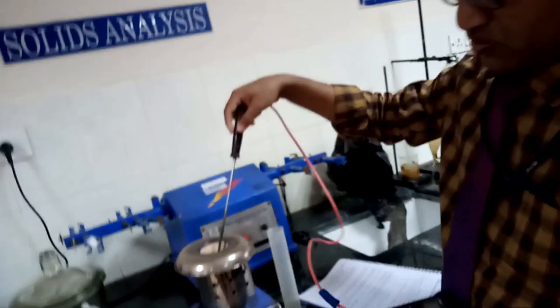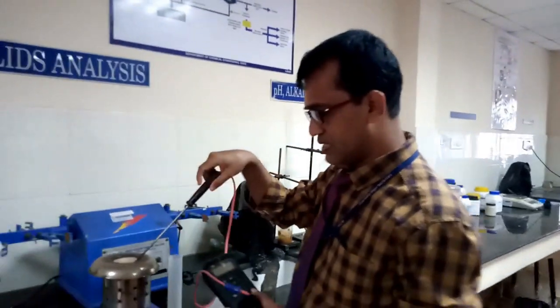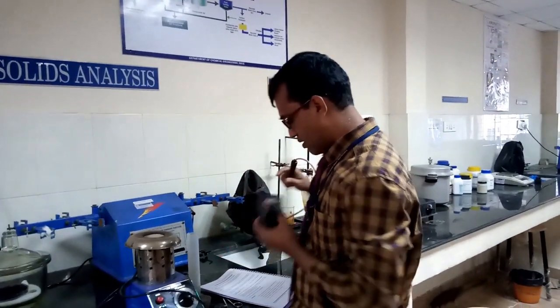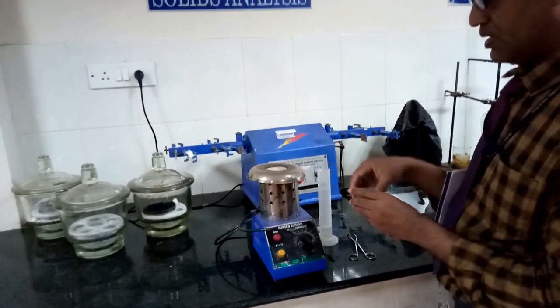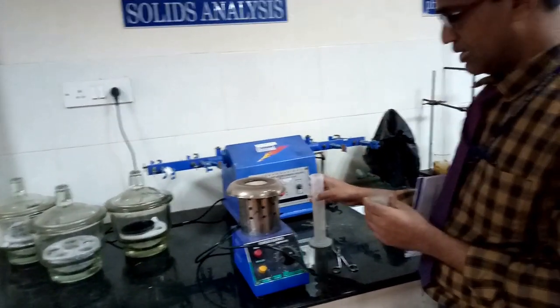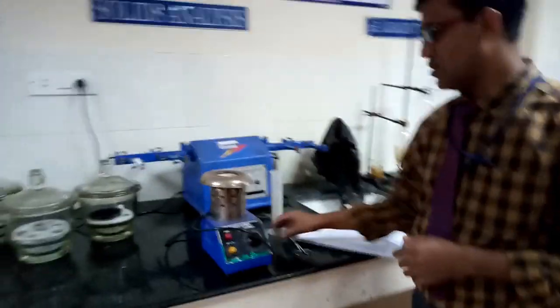You can find out the temperature by using the temperature probe, and the display gives the temperature inside the furnace. Once it reaches 550 degrees centigrade, you take the sample in the crucible as mentioned in the procedure, and then keep it in the muffle.